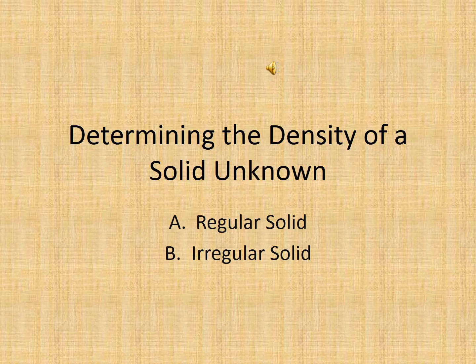Welcome to the pre-lab lecture for determining the density of a solid unknown. This lab is so exciting we decided to put it into two parts. But don't worry, you don't have to wait. You get to do both parts in one day. You're going to determine the density of a regular solid and an irregular solid. For more of the exciting details, I suggest you move on to the next slide.